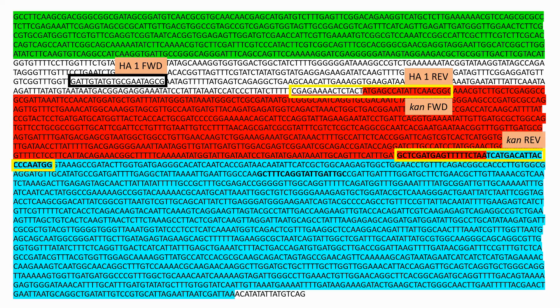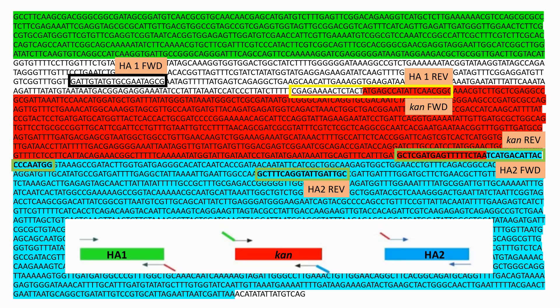The kanamycin reverse primer is now highlighted. This has an overhanging sequence homologous to homology arm 2. The homology arm 2 forward primer has an overhang matching the kanamycin reverse sequence. Finally, the homology arm 2 reverse primer site can be seen highlighted. The image represents what the primers should amplify along with their overhanging sequences. Here you can see the kanamycin reverse primer sequence, along with the overhang identical to the homology arm 2 sequence.